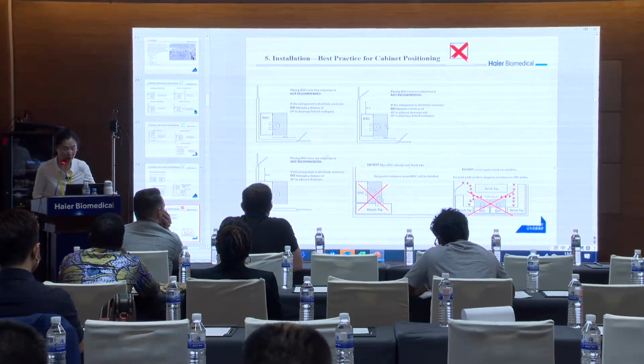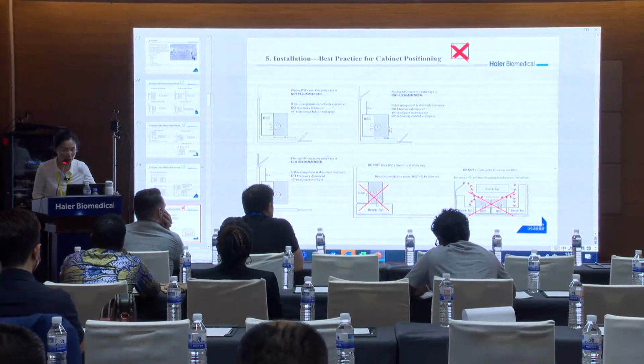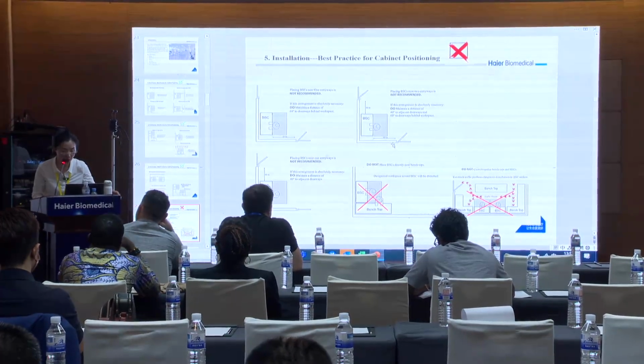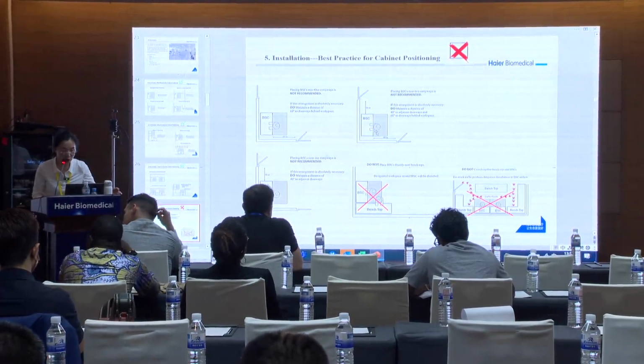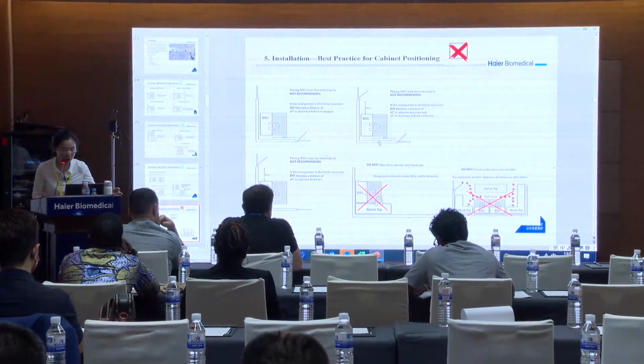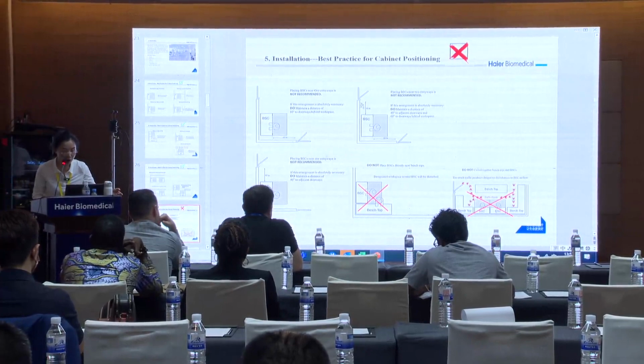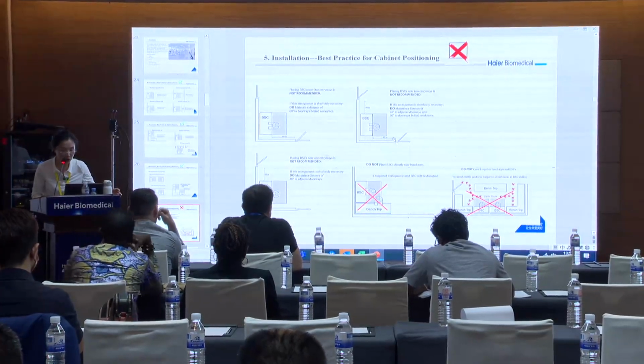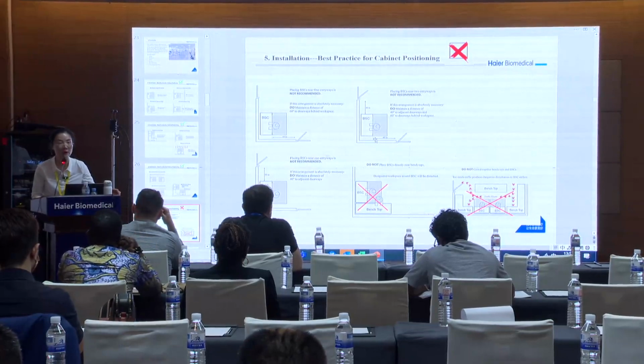And in another situation, placing biosafety cabinets near two entryways is not recommended, but if this is necessary, maintain a distance of 40 inches to adjacent doorways and 60 inches to doorways behind the workplace.